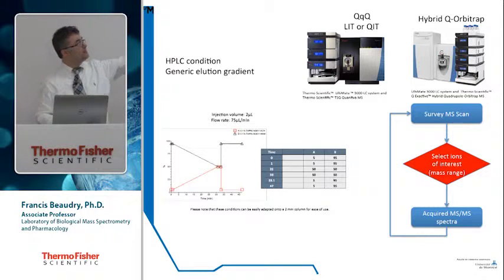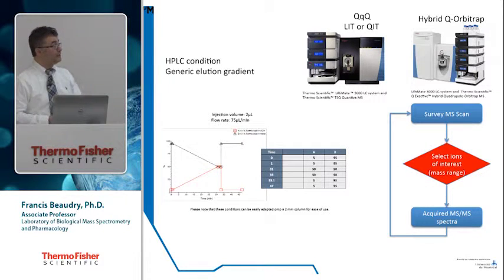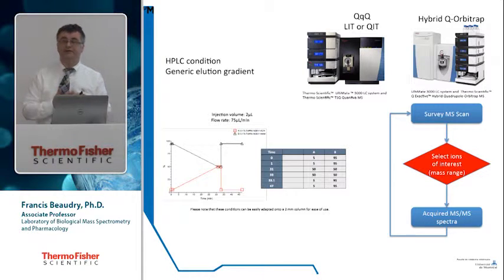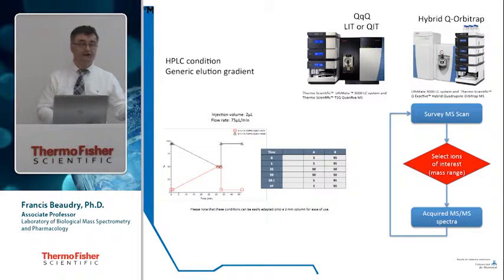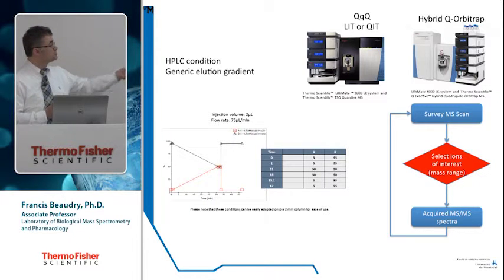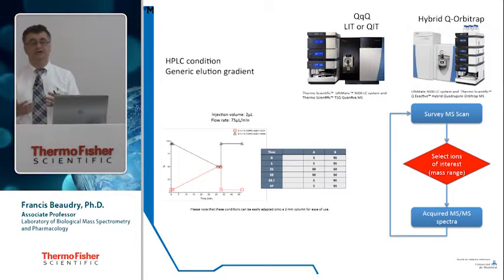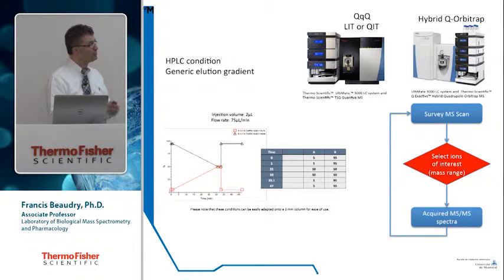You can use an Orbitrap, a Q-Exactive, and I recommend you use a Q-Exactive, but you could potentially use a triple quadrupole, or even a linear ion trap. In my laboratory, we do have a linear ion trap as well as a Q-Exactive. We test the method on both. It works with the linear ion trap. The only thing you have to do is to increase the gradient time. Instead of a 30-minute gradient, it's going to be a 60 to 90-minute gradient to improve selectivity during the chromatography. But it's workable.